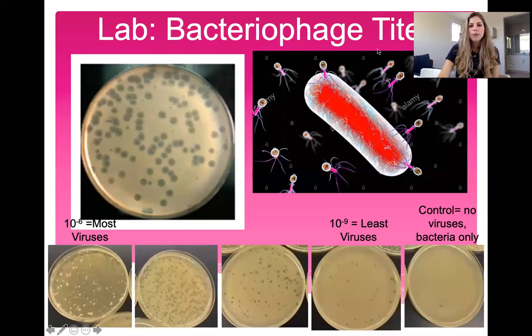Everyone, in this lab, we're going to talk about the bacteriophage titer experiment. In this experiment, you're basically going to work with bacteriophage, which are just viruses that infect bacteria, and use them to infect bacteria and see what happens. Bacteriophage is just a fancy word for viruses that infect bacteria. They're sometimes also just called phage.